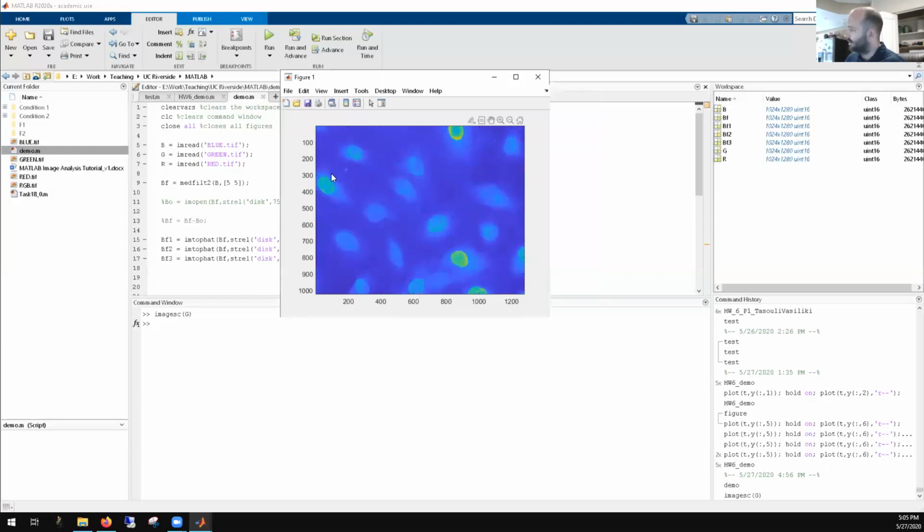So this is our image, and basically this is an immunofluorescent stain for a protein called Nesprin-3. And as you can see, Nesprin-3 is mostly localized to the nucleus. You can also see if you kind of squint a little bit, you see how it's enriched on the outer envelope of the nucleus, and less so in the center. You can see that especially here. You have kind of a ring of Nesprin around the nucleus. So Nesprin normally localizes to the nuclear envelope. So that's basically what we're seeing here.